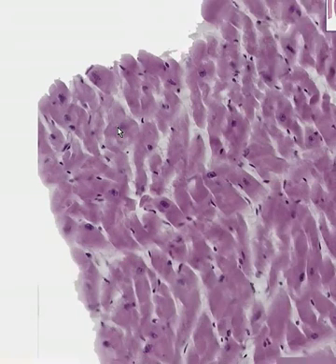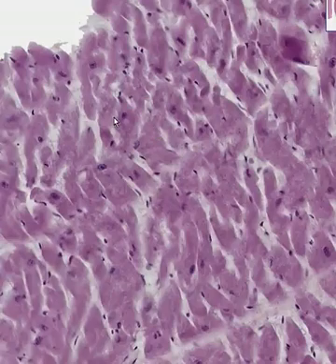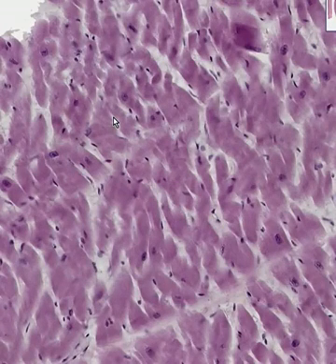Let's keep on moving away now from these nice smooth muscle fibers and go on to our third type of muscle, which we are going to be seeing very soon, I hope. And sure, we have just landed on the coast here, and we can start to see some muscle fibers now in which I think you will admit it's a little bit more difficult to see the striations. Let's go to a different area.